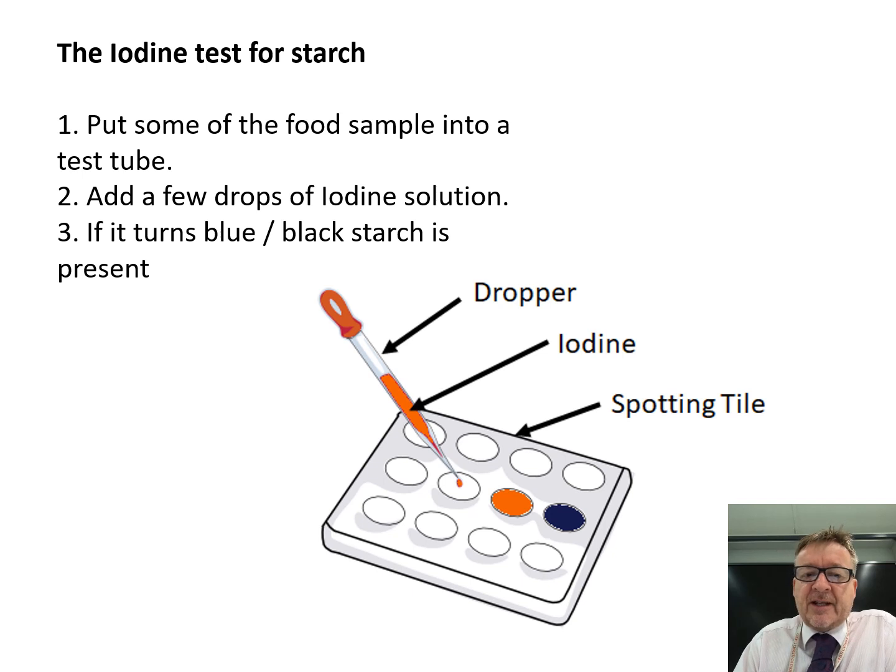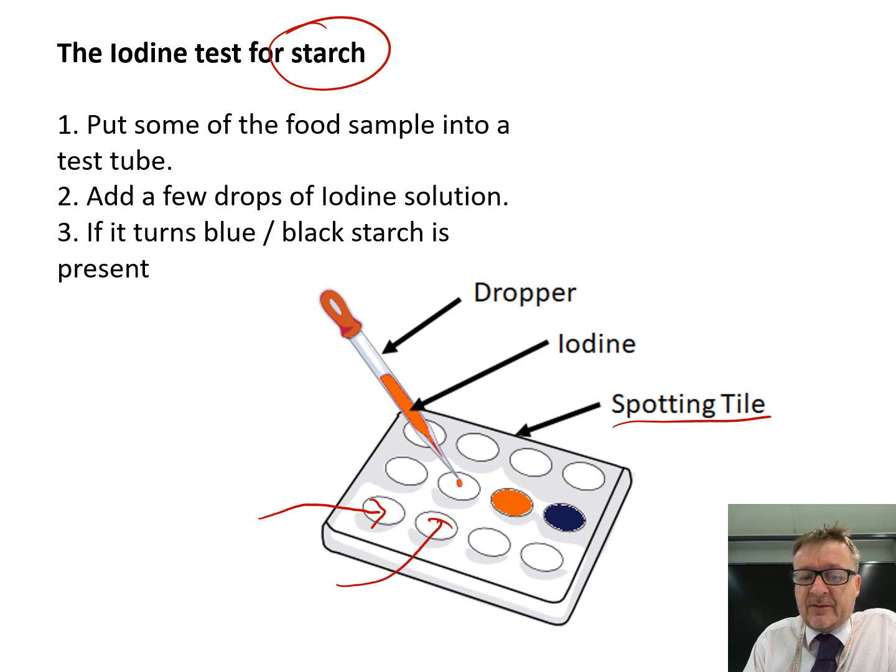The first test is the iodine test for starch. Now, iodine is a stain — if you get it on your shirt it'll go black, if you get it on paper towels or the desk it'll stain. The best way of doing this is to put a piece of food sample into one of the little dimples on a spotting tile.